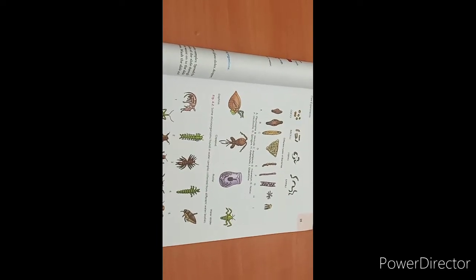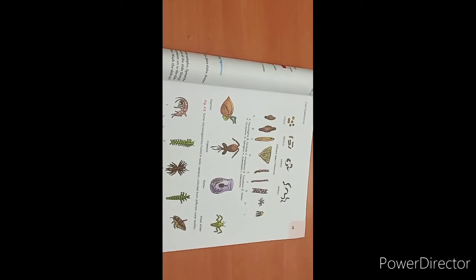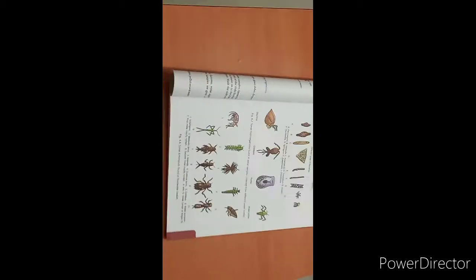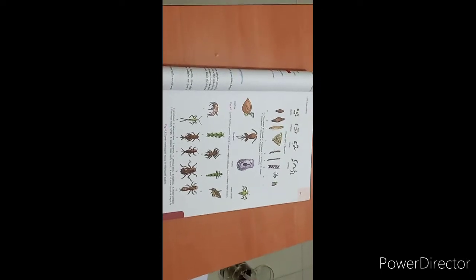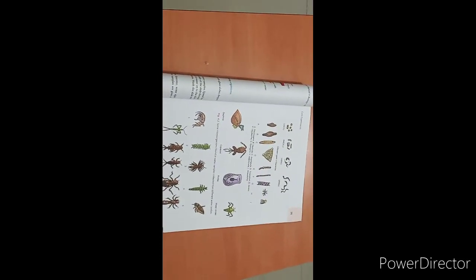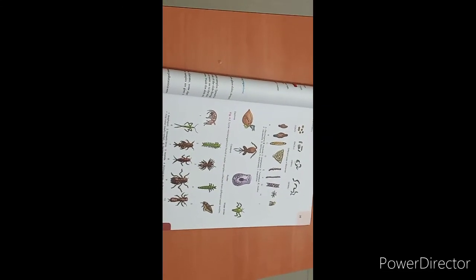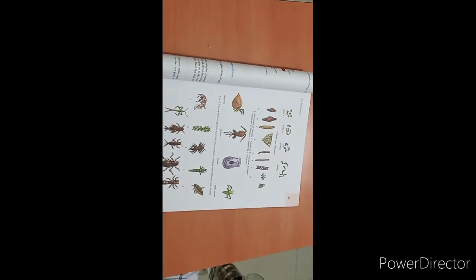And these pictures, the diagrams which are shown here, you can draw under observation. So this will be your observation, children. For sample A, because it is taken from tap, there will be no microorganisms seen in that, as we have already seen. And in sample B, you can see few microorganisms if it has a large number of organisms present in it. So diagrams can be drawn for observations.